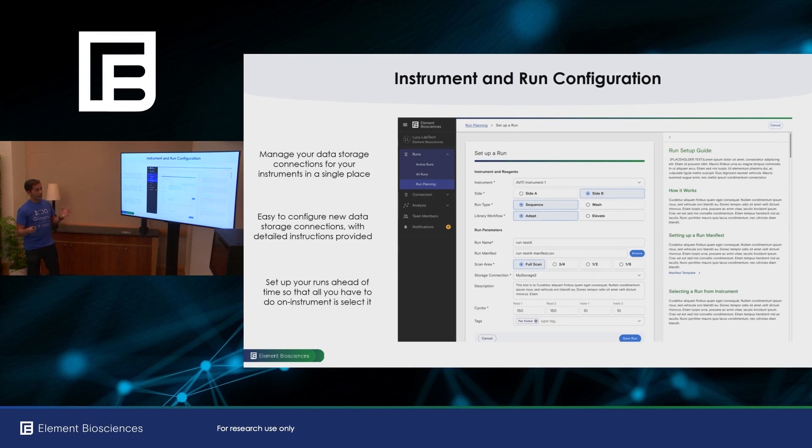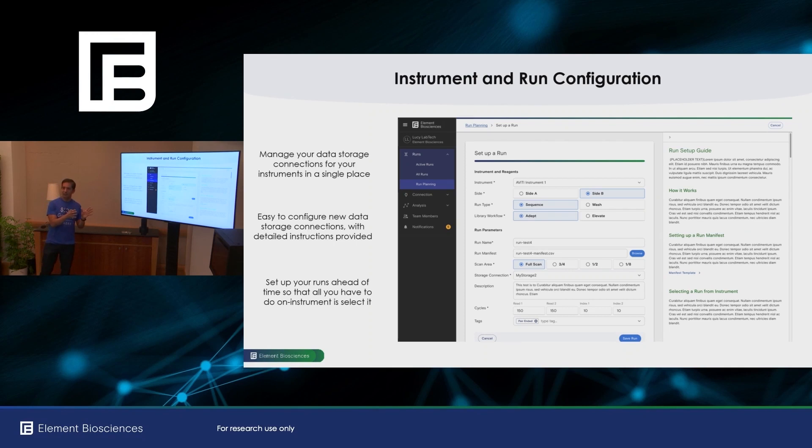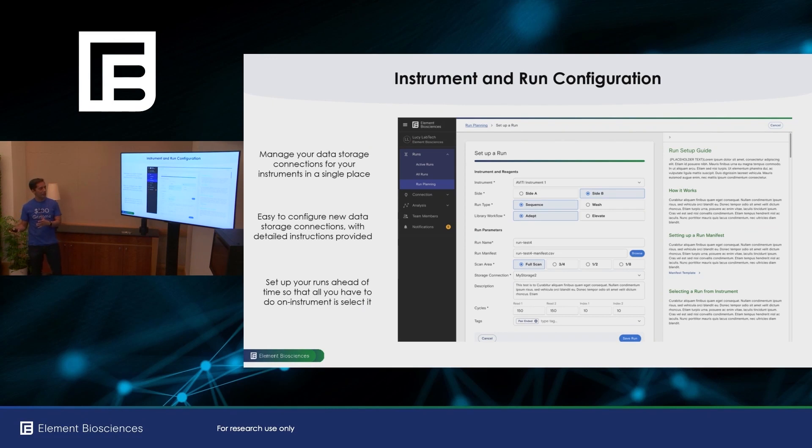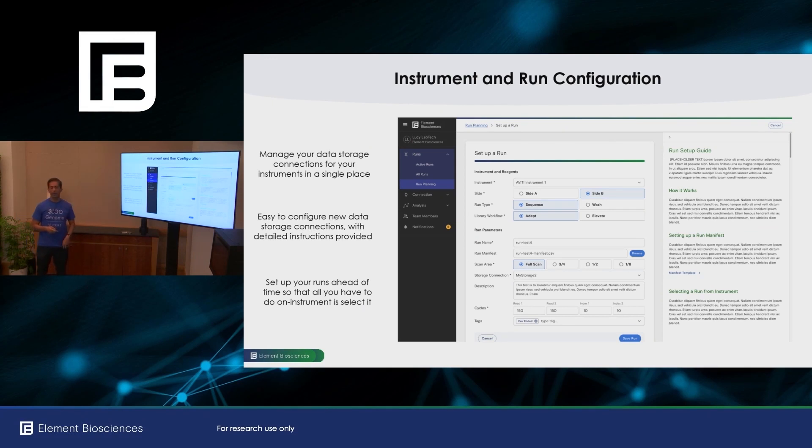The other thing that's really nice about Element BioCloud is that now you don't have to set up your run information on the instrument itself. You can do that at your desk, set up your run, and then they'll be available when you get to your instrument. And all you have to do is select it and go.